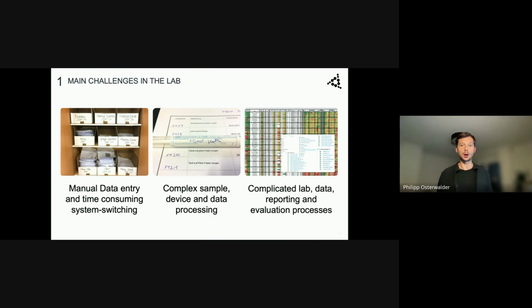Maybe you heard them from auditors during some audits, but we ask them in our regular workshops, and we already had some experience. It took more than 2 days to get answers to some specific questions about article analyzed results, and this is ridiculous.